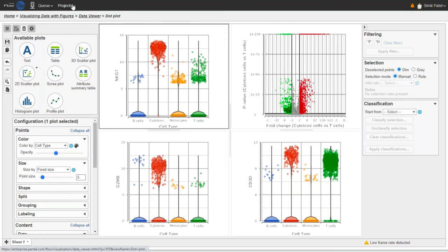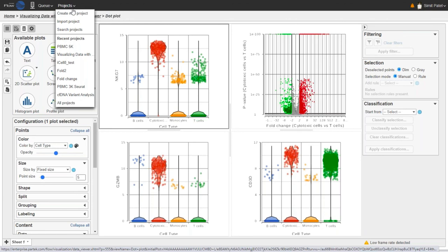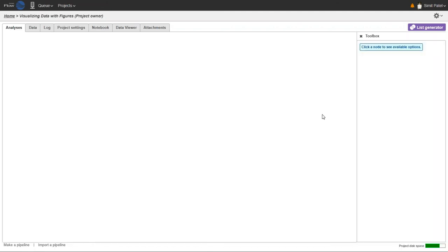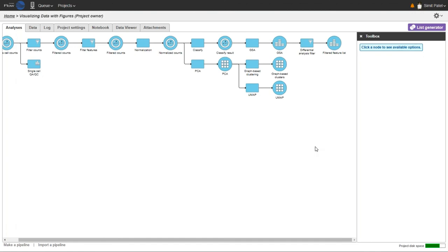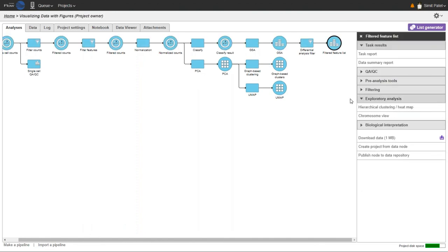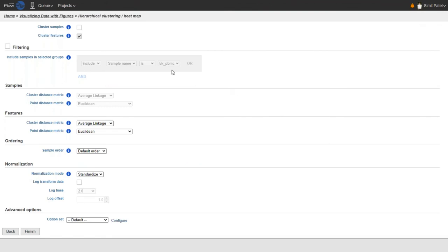Finally, I want to talk about heat maps. Heat maps tend to work best on a smaller number of genes, so it's usually a good idea to filter down to a subset of meaningful or interesting genes first — here I've filtered down to significantly differentially expressed genes. To run hierarchical clustering or a heat map, select your data node, go to Exploratory Analysis, and choose Hierarchical Clustering or Heat Map. It's usually better to cluster just on the features or genes, and for single-cell data it's usually best to leave the 'cluster samples' option unchecked, because clustering on cells doesn't work well due to the sparsity of the data.